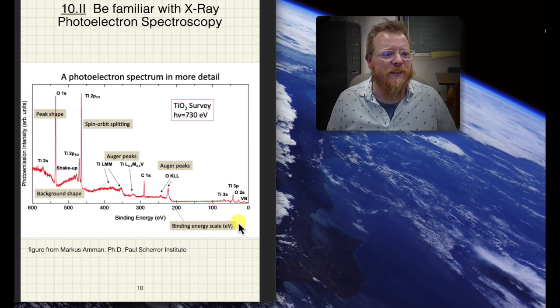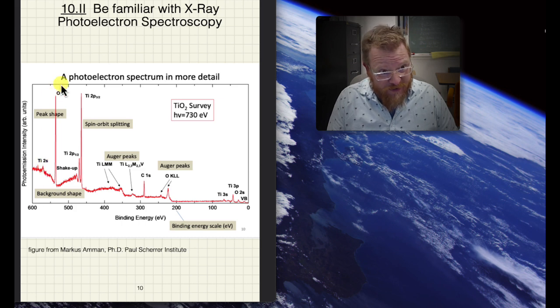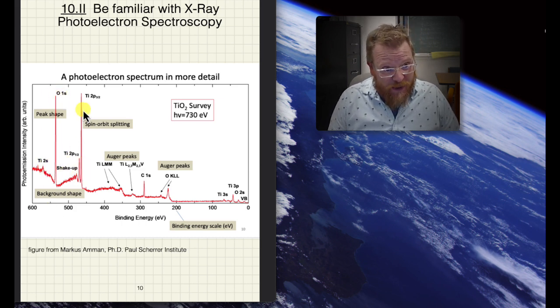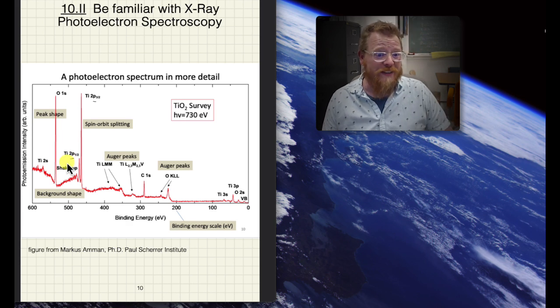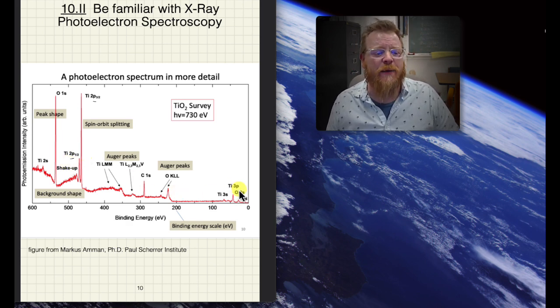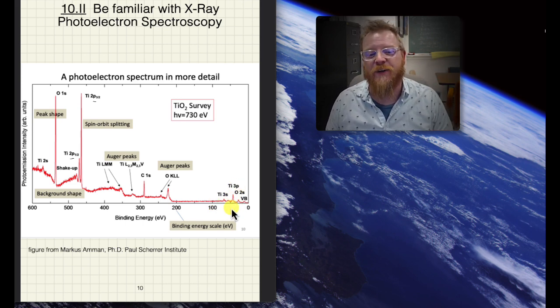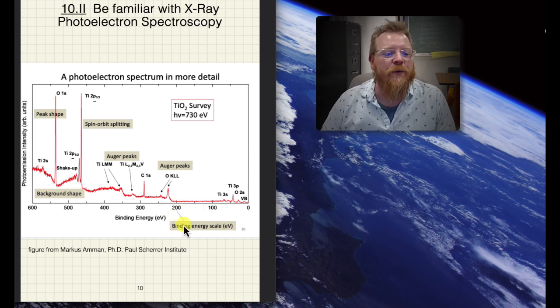So let's talk about some of these peaks. So again, we noted the core levels have the highest binding energy. There's titanium 2s, there's oxygen 1s. Now we can see spin orbit splitting in the low J and high J value for the titanium 2p. Once we get to titanium 3p, that splitting is present, but it's so close together it's hard to resolve on this scale. And then now we notice there's a whole bunch of other things here.